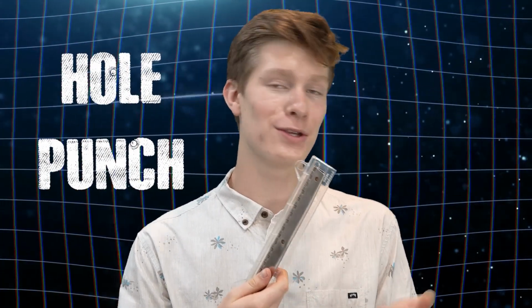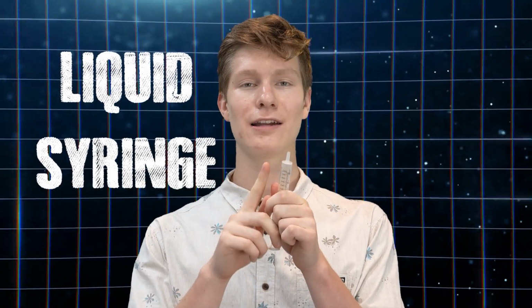The next thing that you're gonna need is some kind of hole punch. In my case, we only have a 3-hole punch, but you can use any kind of hole punch that would give you a small circular disc that you could insert into some water. The next thing that you're gonna need is a liquid syringe. So this isn't a kind of syringe with a needle in it or anything like that, but it is able to hold pressure, and you wanna make sure that when you put your thumb on it, it's able to hold back and keep pressure inside of it.